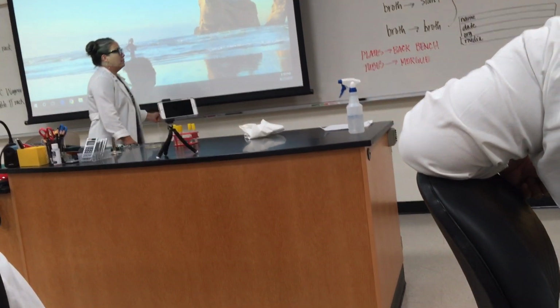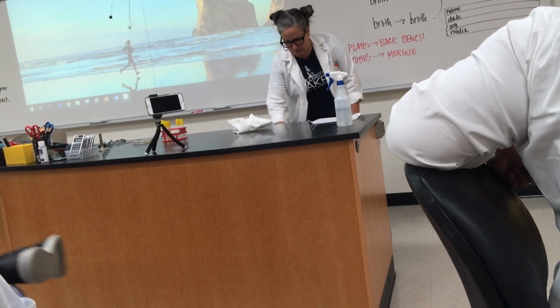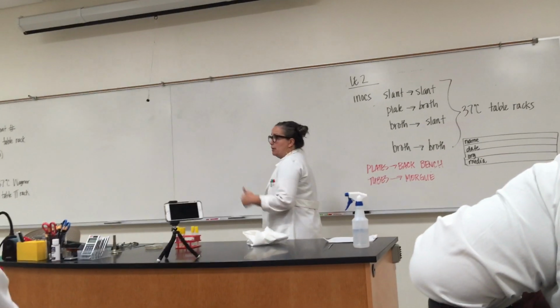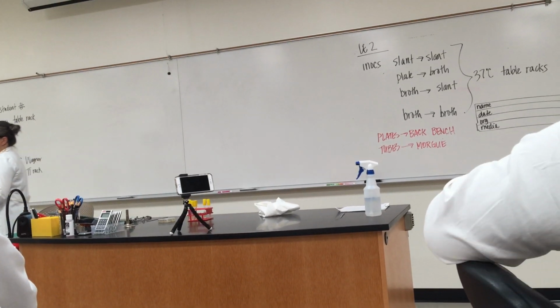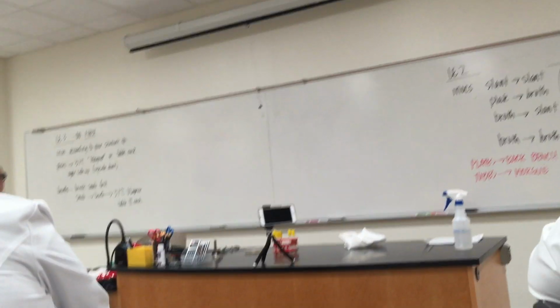So let's talk about our labs that we're going to be doing today. You have 2 labs to do today. That is not uncommon. It is very common that you will have to prep and perform more than 1 lab a day because a lot of these labs take very little time to finish, and we want to make sure that you're exposed to as many techniques as possible.